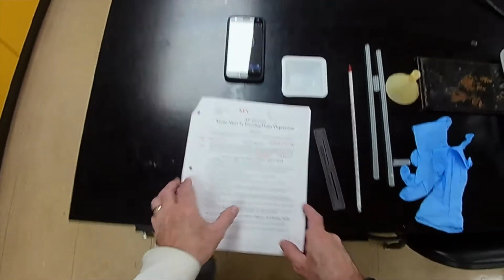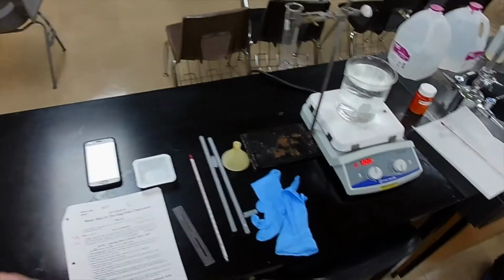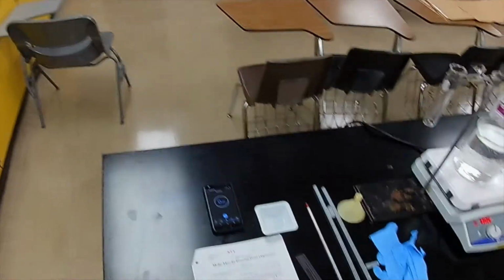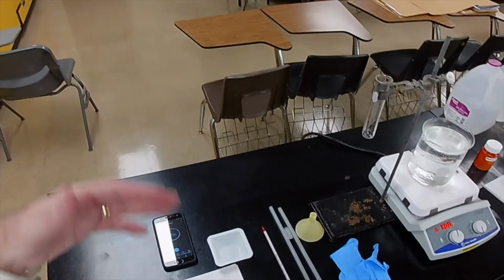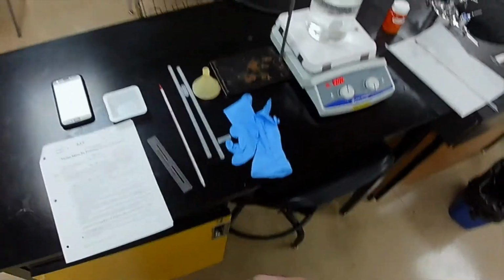Okay, I also have a timer set up here. So these 30-second intervals are continuous. That is, once you start the timer, you don't stop it. You take a measurement every 30 seconds. And the time it takes me to go over to the board and write the value of the temperature should be 15 or 20 seconds. So very shortly, when I return, it'll be time to take another measurement. So this is going to go rather quickly. All right.